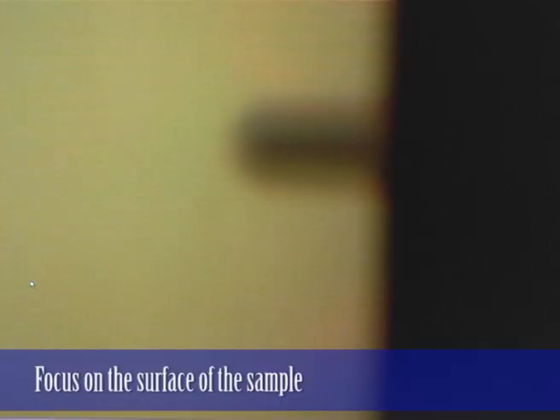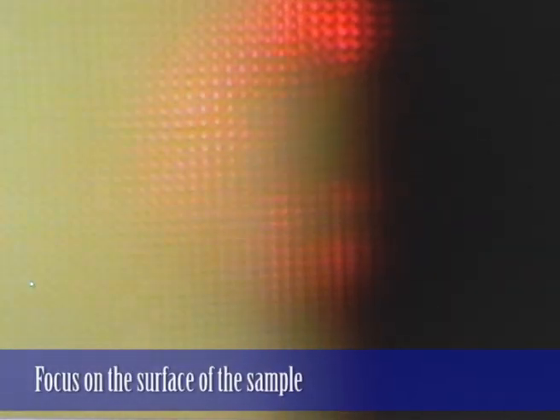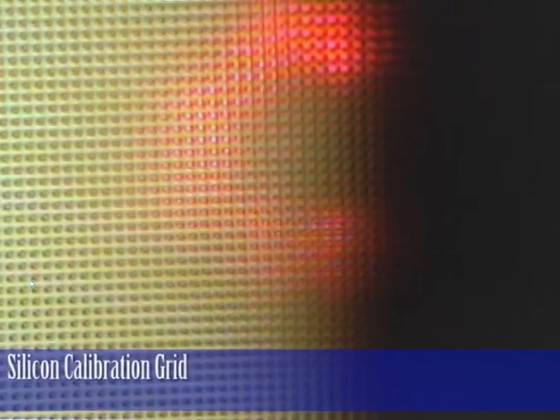We're now focused on the cantilever. I'll go back down to the surface — the surface is a calibration grid.